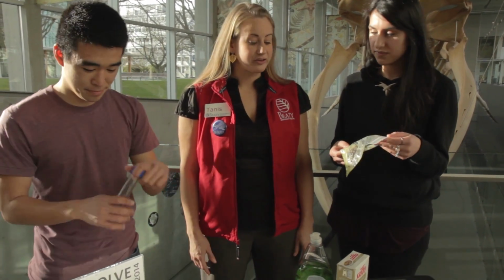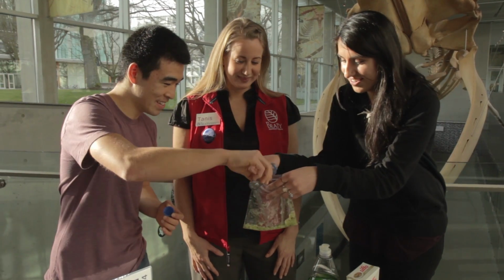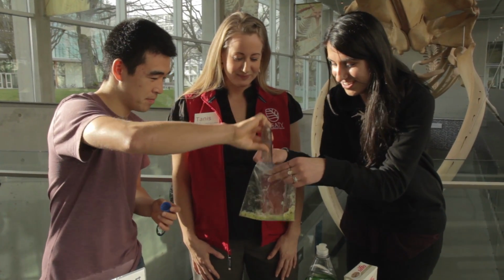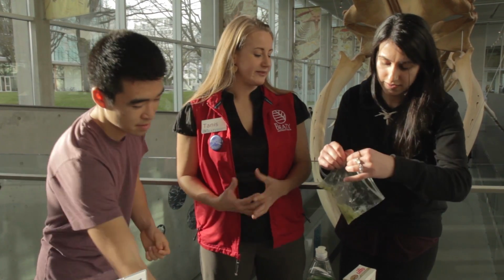The next step is to add the salt solution. So this solution is actually just made out of regular table salt, and we add it to stabilize the DNA so that it comes out in nice long strands. Cool. And just pour it all in? You bet. All right, here we go. Just squish it a little bit more? Yes, so we want to get that nice and mixed in there.